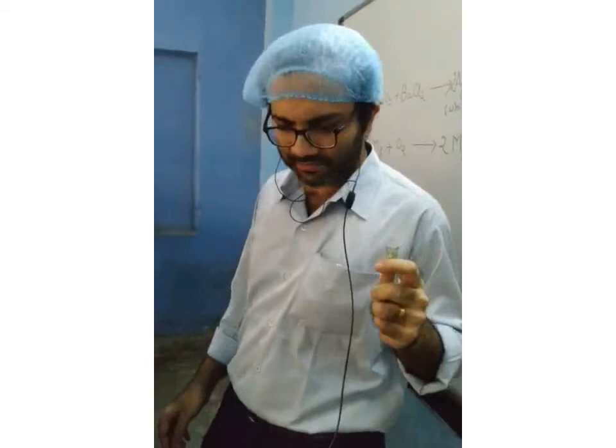You have just witnessed how the observations come up when two chemicals are mixed. As I said before the experiment started, the copper sulfate solution and the ferrous sulfate solution interact with one chemical, ammonium hydroxide.